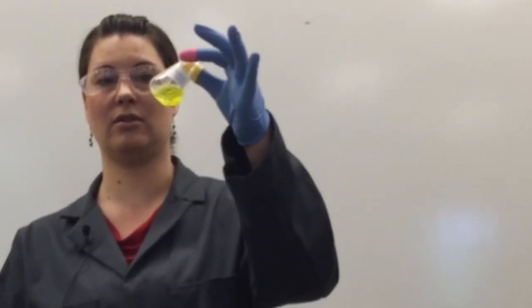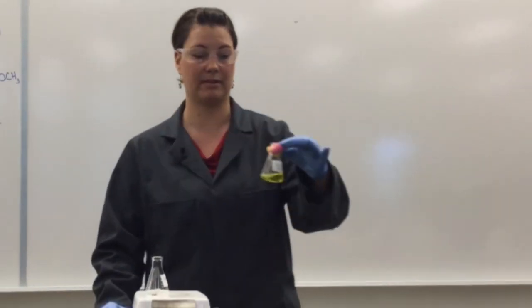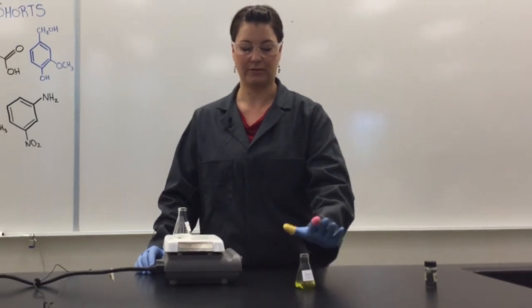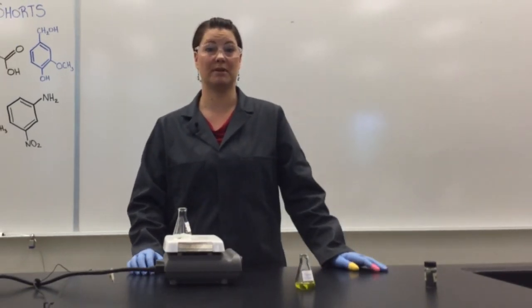At this point I can see that all of my solid has dissolved and I have a nice transparent solution. So I can remove my solution from the hot plate, put it off to the side, and allow it to cool to room temperature.